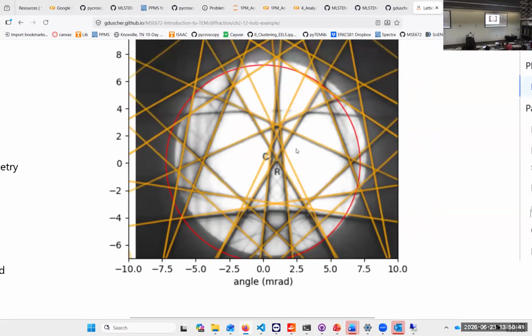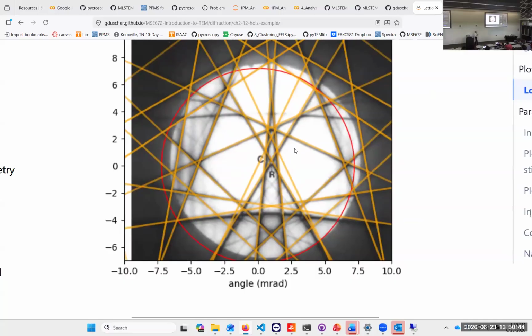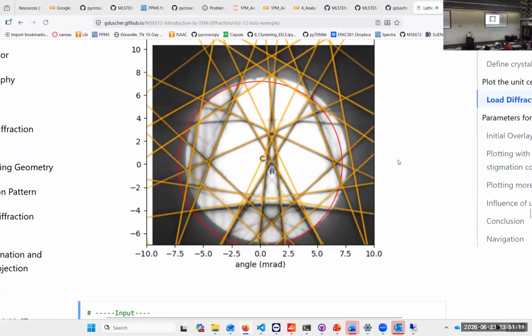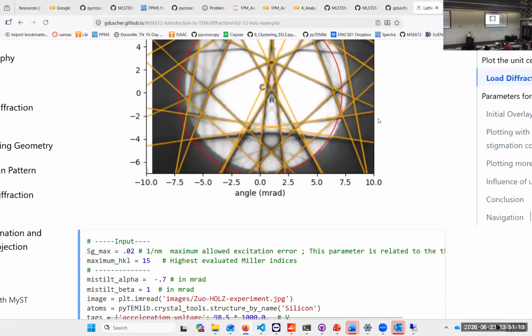and you can see that actually also in the disk itself. You can see that the left-hand side has many more stripes than on the right-hand side. So the distribution of the intensity is not perfect. Now, something like that can, of course, be calibrated with an automatic beam tilt by itself very easily.